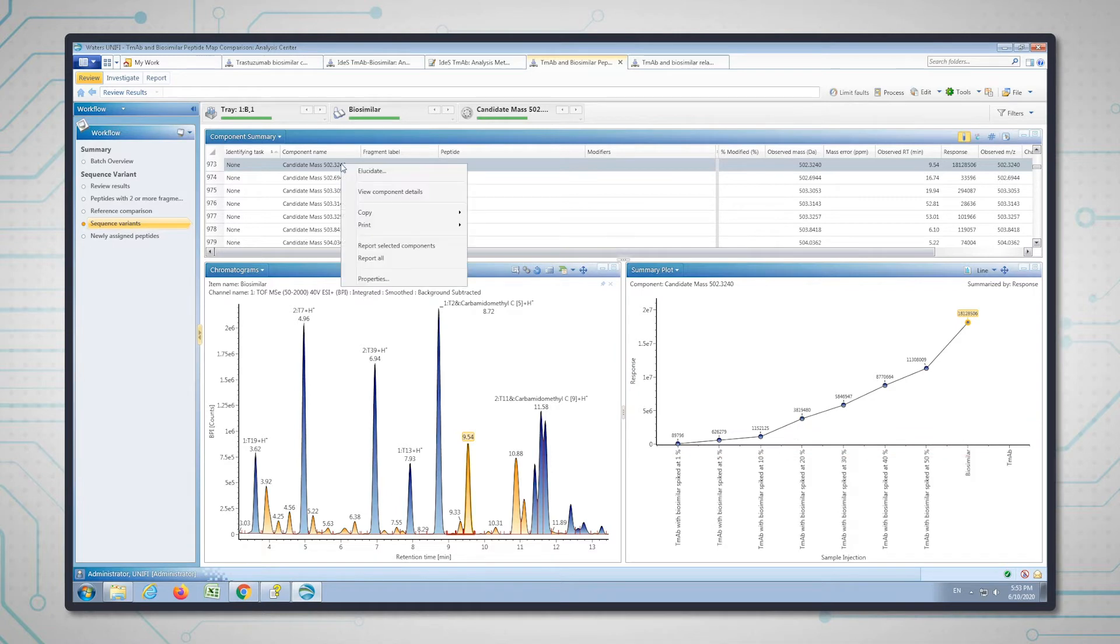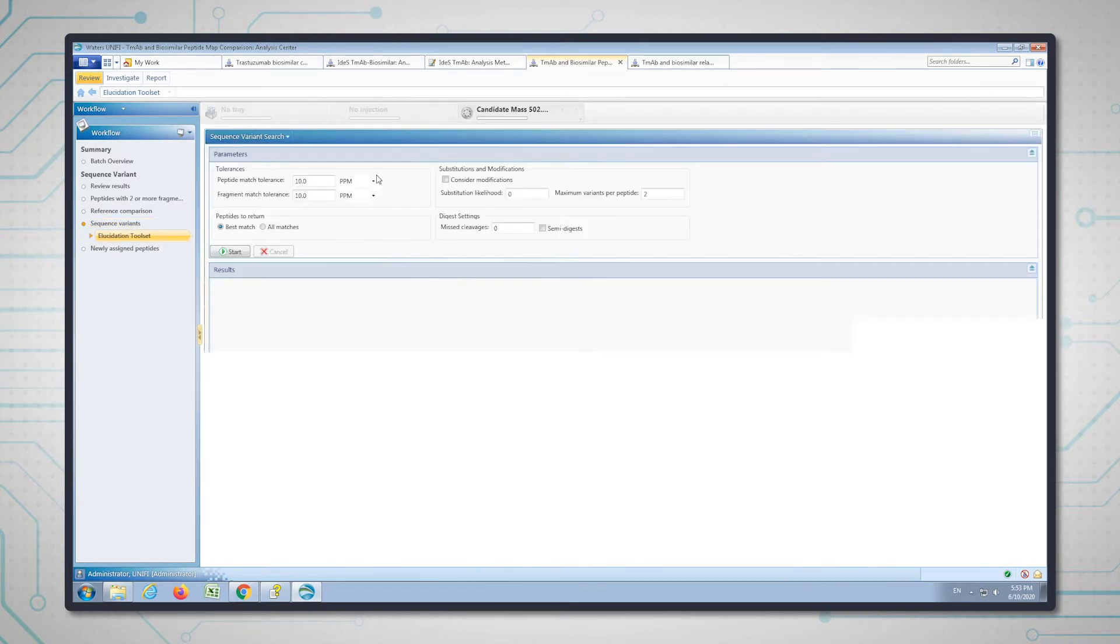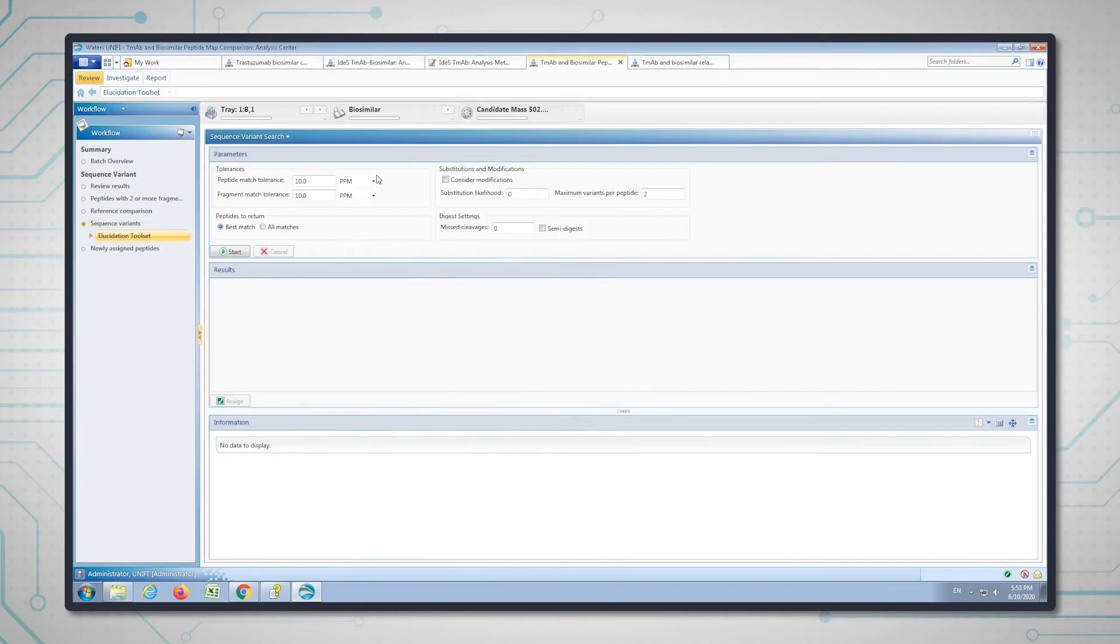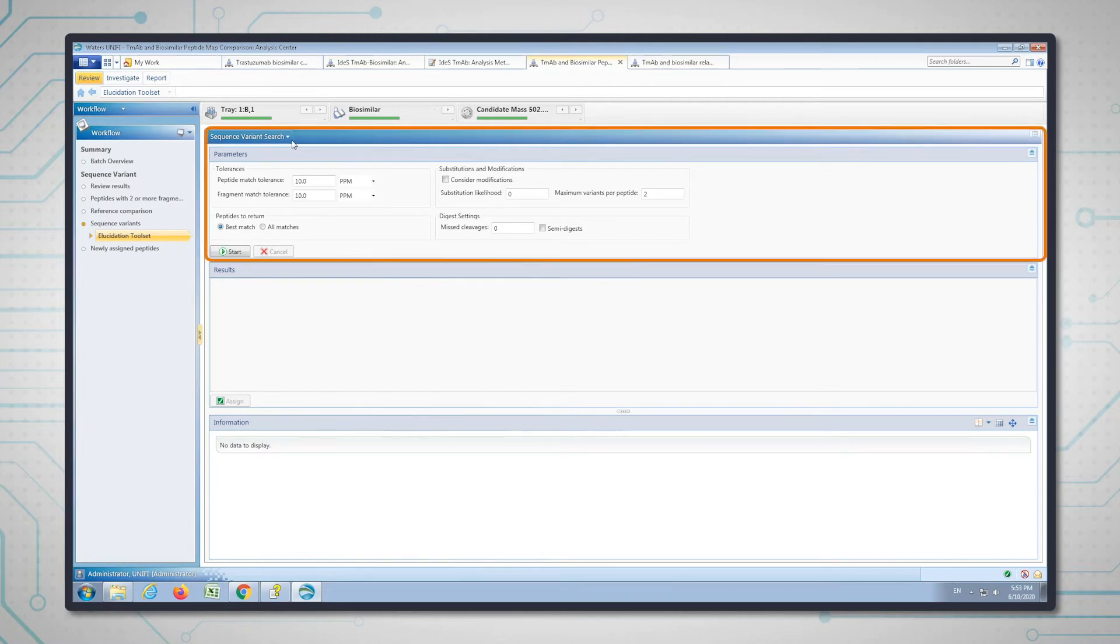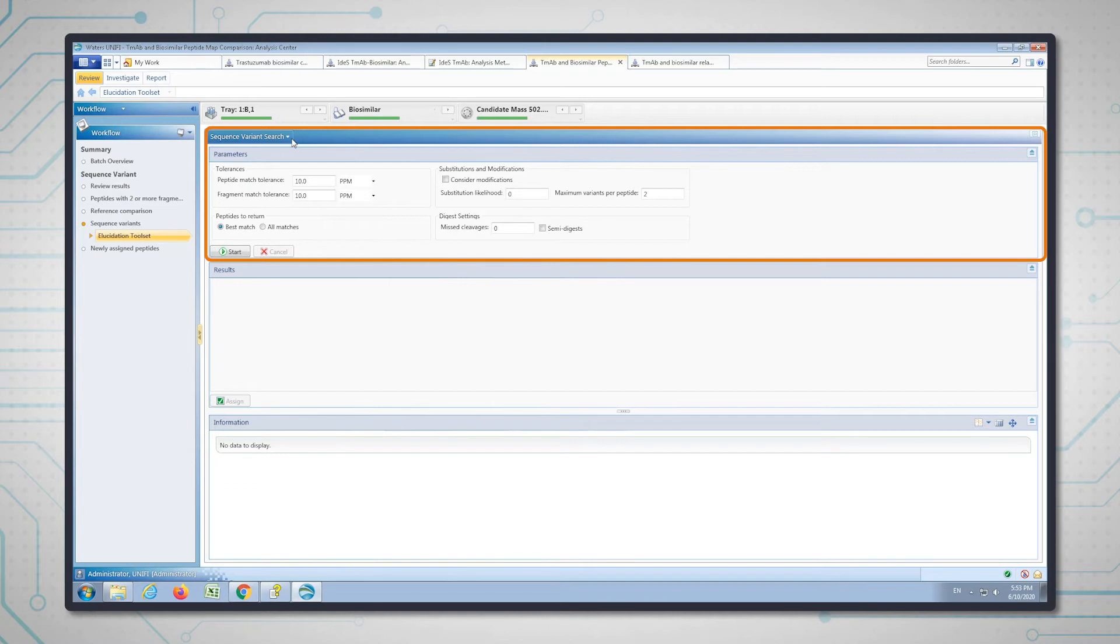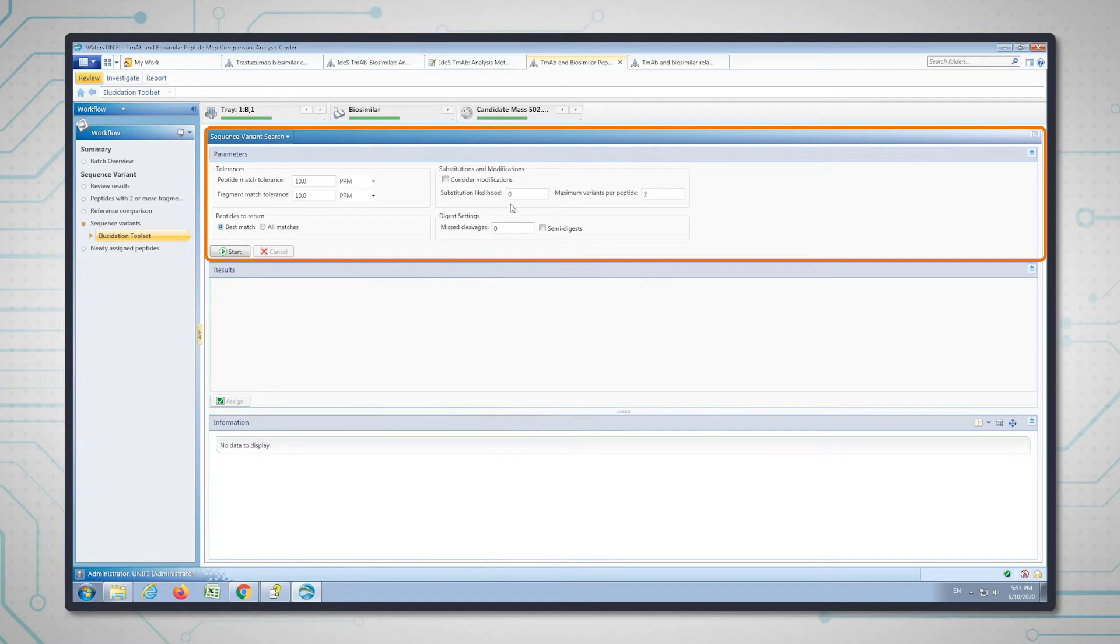If I right-click on this candidate mass and say elucidate, it will take you through to a suite of tools that can be used to see what the amino acid sequence is. We're going to use a sequence variant search. This is going to take the in silico list of digestive peptides from the trastuzumab sequence, the innovator sequence, and see if it can change one or two amino acids in each peptide sequence and match it to both the precursor and the B and Y ions for this candidate. I'm going to change this number here, which is what's used to find the sequence variant based on the blossom matrix.